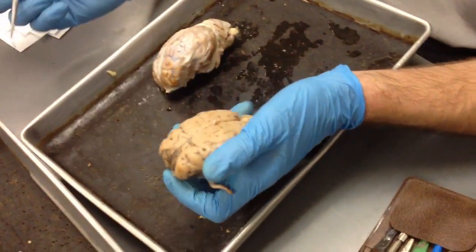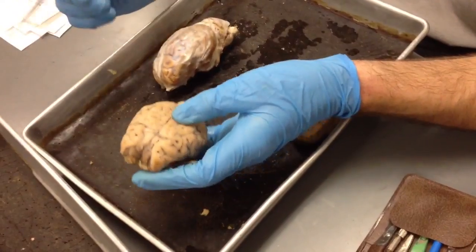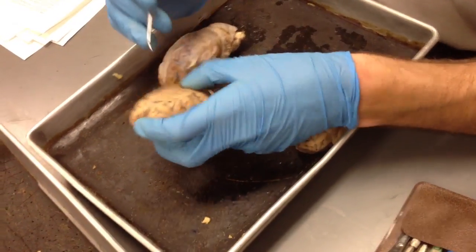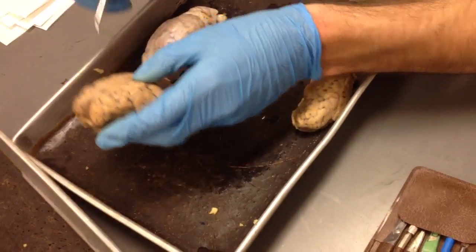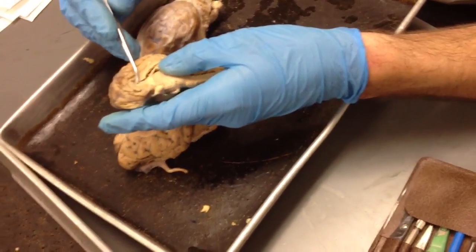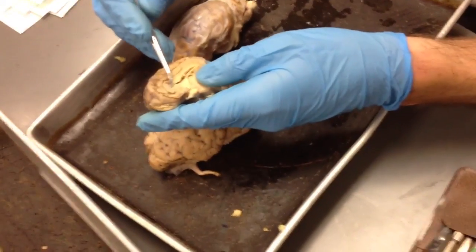Our cerebral cortex is connected and is able to communicate between the two hemispheres via the corpus callosum, which, if you split this, you can see it's the white structure in here, but it's more easily viewed right here. The top white portion is the corpus callosum.